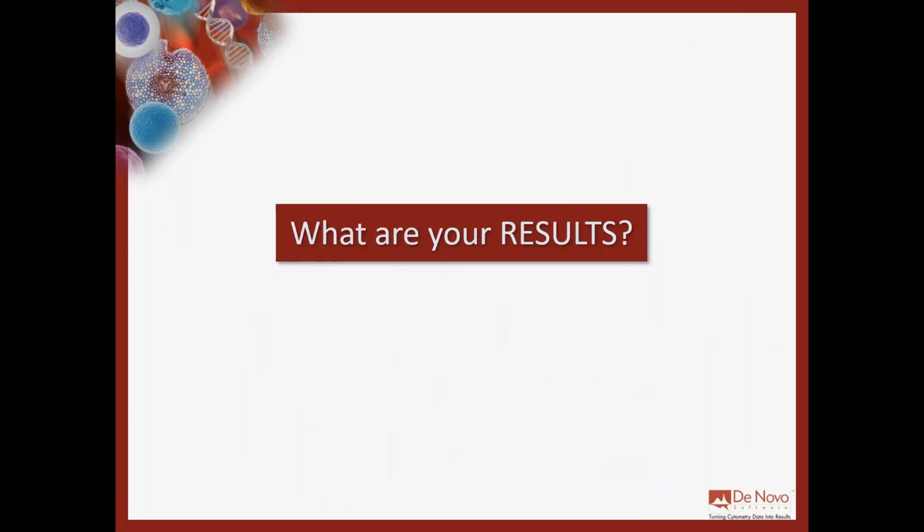So what I've done was put together examples, and I have three main sections. The first one is a general example on how you can start your analysis in FCS Express. This will give you the idea of how easy and user-friendly FCS Express is, and also how it can help you create high resolution graphic pictures.